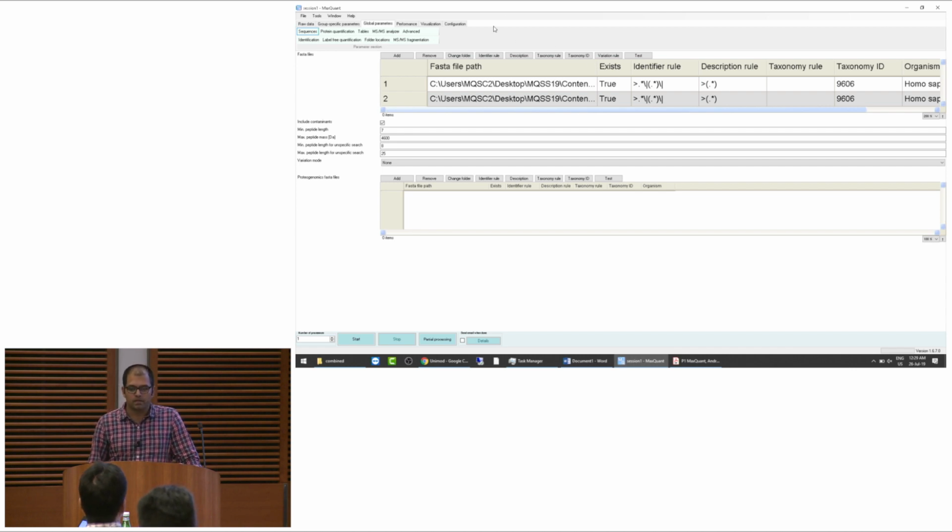So we move to the TMT maybe. There's one question here. It's kind of specific, might be beneficial to others. Let's say I have a few samples and I have a priori knowledge that they are different, heterogeneous, and I still want to do relative quantification. Should I be changing one of the default parameters or just leave it as it is?